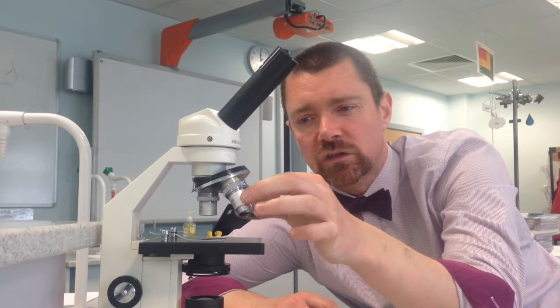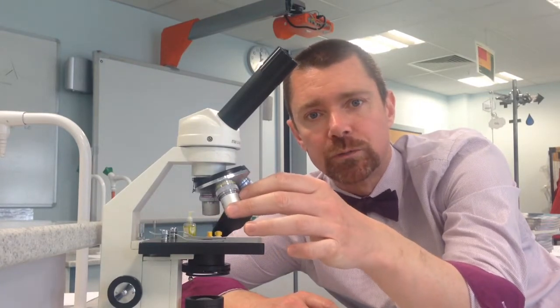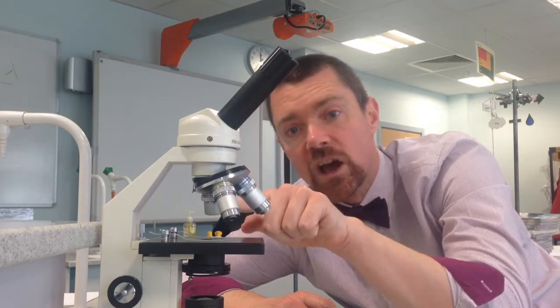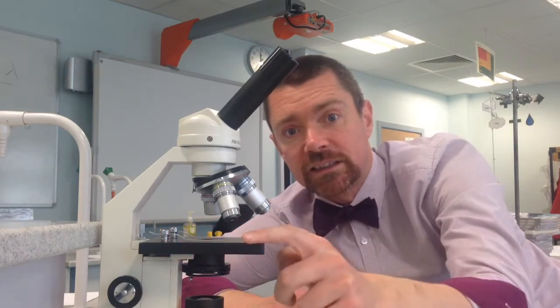We've got a section here which sort of spins round and round. This is called the revolving nosepiece. Attached to the revolving nosepiece there are three objective lenses. There's a flat platform here that is called the stage and it's got a couple of metal clips on it.